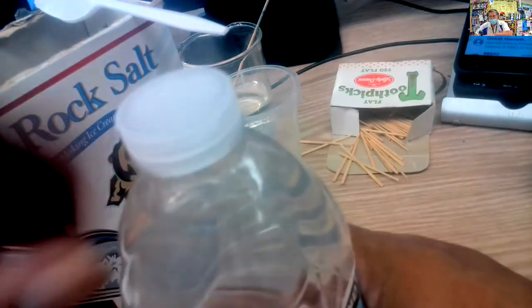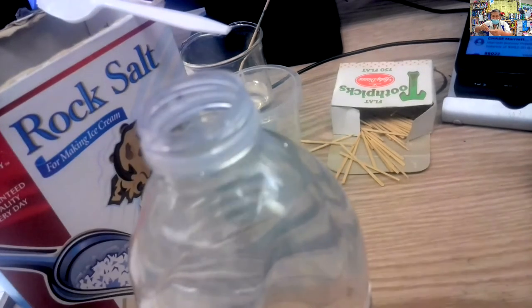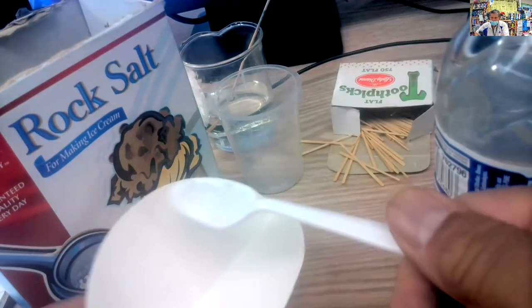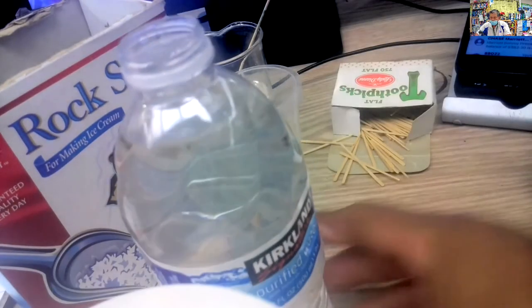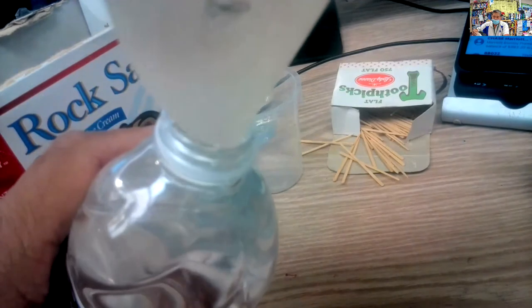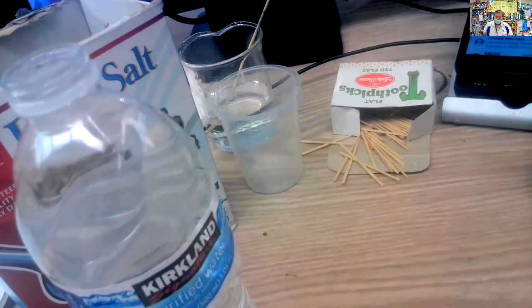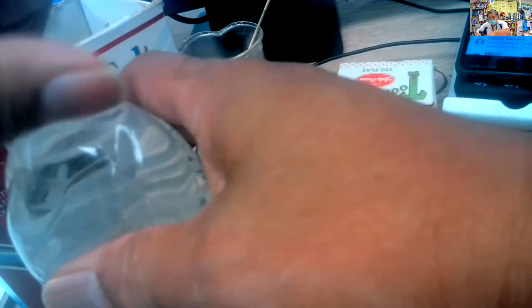So I'm going to put that right there and open this up. And I'm going to put this on a piece of filter paper like this. Okay, there it is. And then I'm just going to pour this in my water bottle. And you'll do the same. It'll be just about the same as the 0.1% salt solution. Remember, you don't have to have filter paper for this. You could just use a piece of scratch paper. And so now I have it in here. Now if I'm going to use this one, then I've got to wait till the rock salt dissolves.